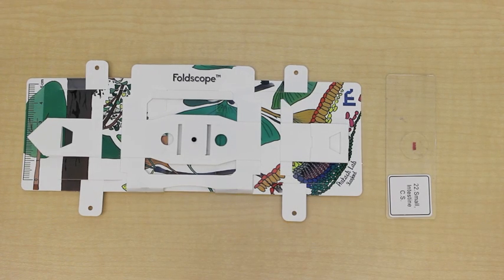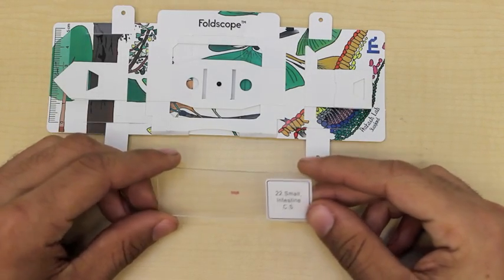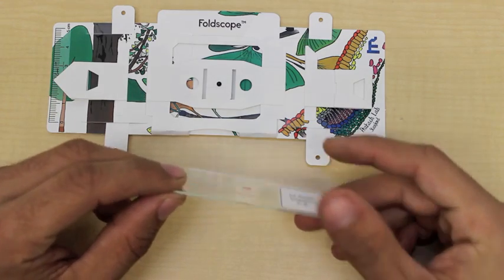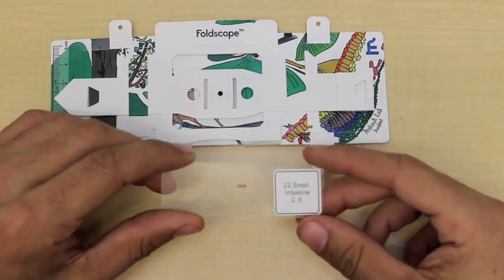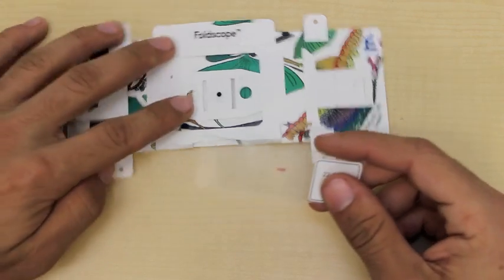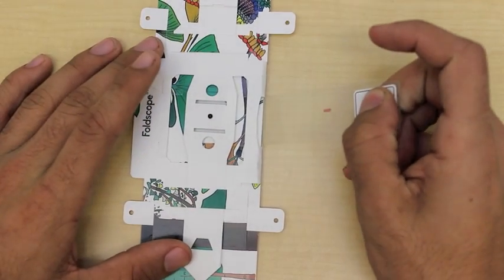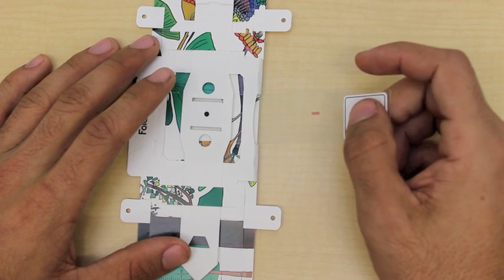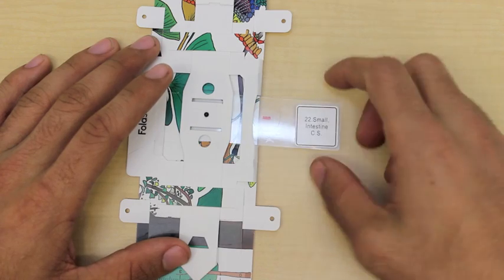The first step to using your Foldscope is inserting the slide. Foldscope accepts standard slides of one inch by three inches and about one millimeter thick, and it can accept glass slides or paper slides that you can make yourself. To insert, we begin by pushing it through the hole at the bottom of the Foldscope. I like to begin at an angle and flatten out as I push in.